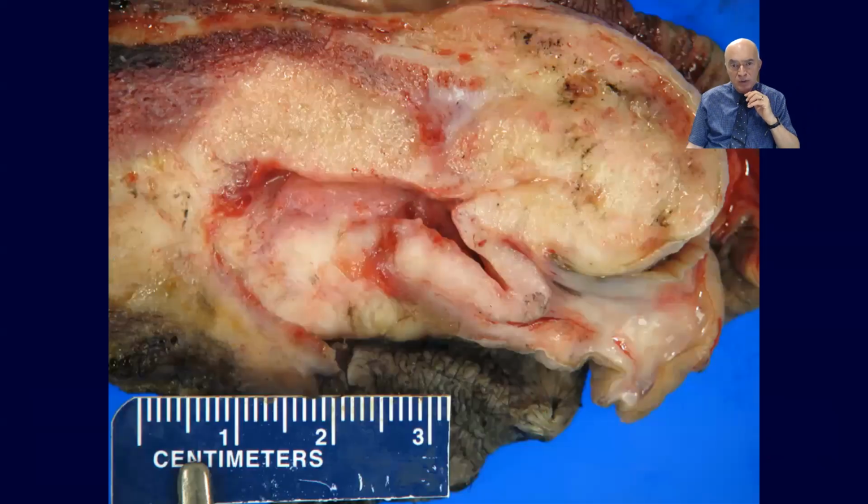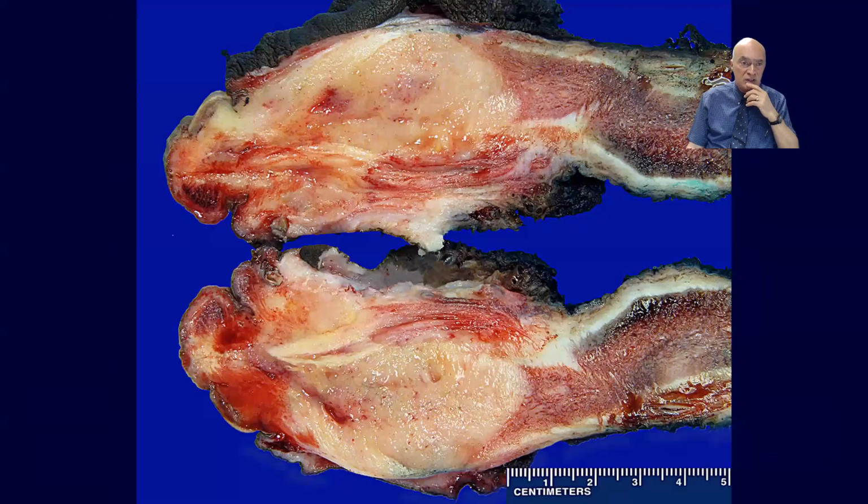This is just a close-up to illustrate this tumor that most likely started in the glans penis and then has extended into the urethra and adjacent tissue in this organ. This is another specimen where you can see the large tumor that likely started here. There is tumor in the glans penis, but its extension is through the erectile tissue and also in the dartos and also the urethra. So a very advanced tumor with a high grade.